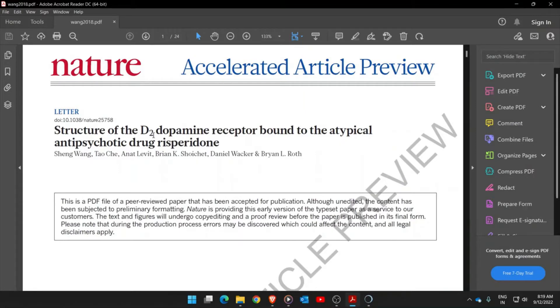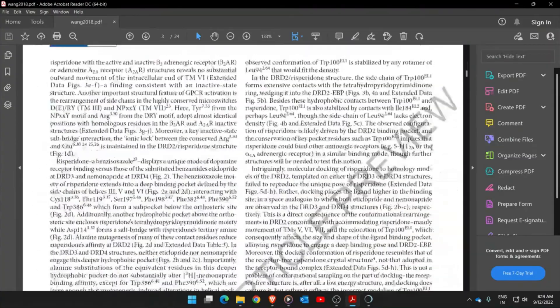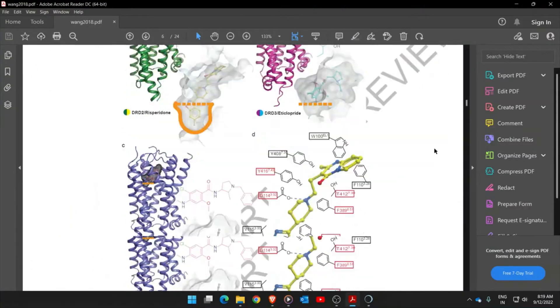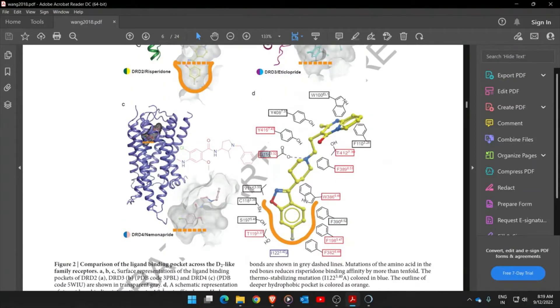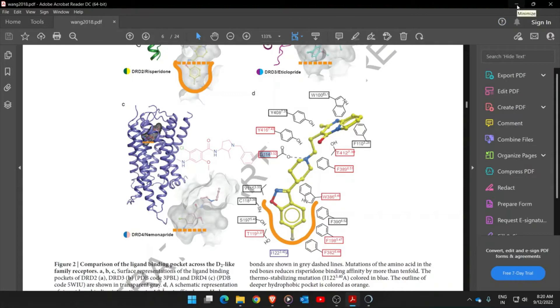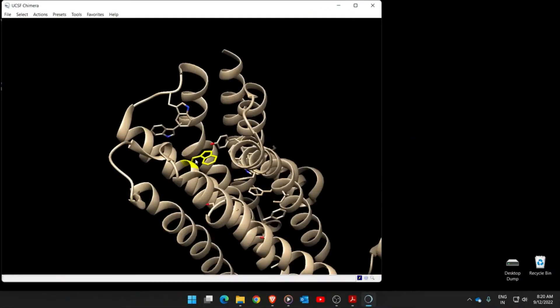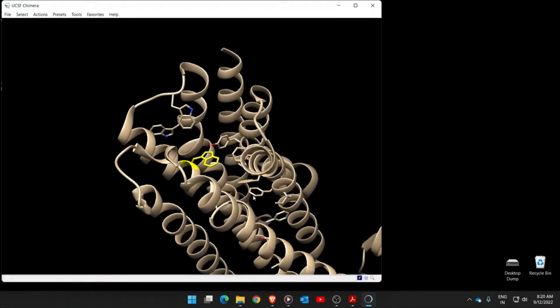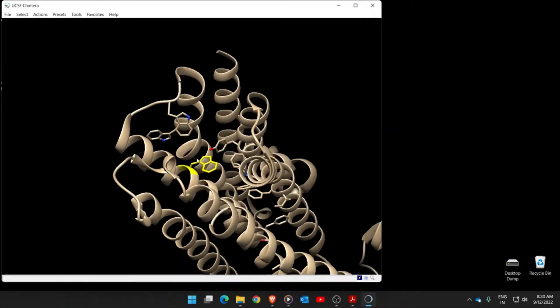In my previous video I explained how we can mutate or engineer the D2 dopamine receptor, which is binding to the drug Risperidone. Briefly, what we did in the previous session is replace the amino acid aspartate with tryptophan. In this video I will explain how this replacement of an amino acid in UCSF Chimera may have caused steric hindrance in the protein active site.